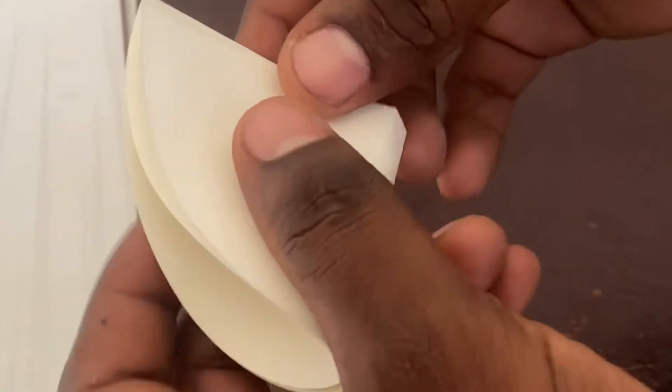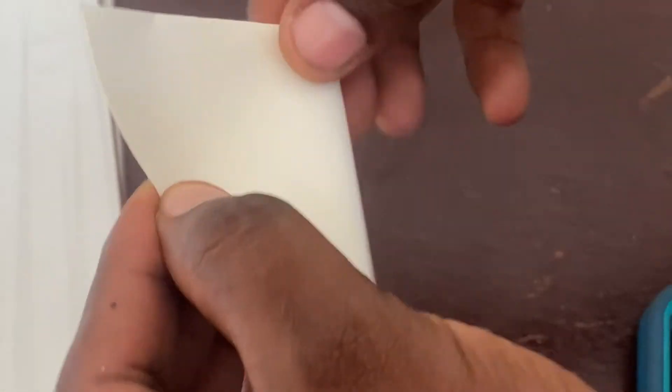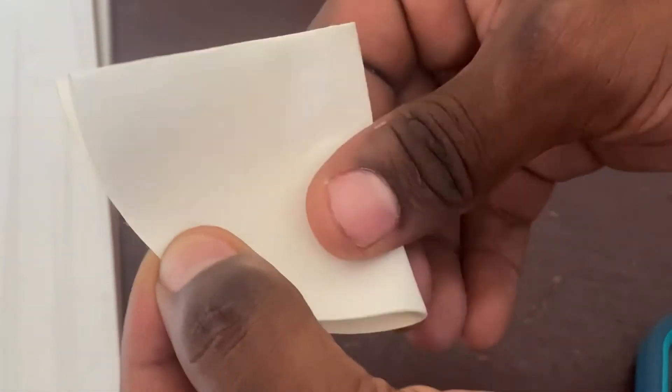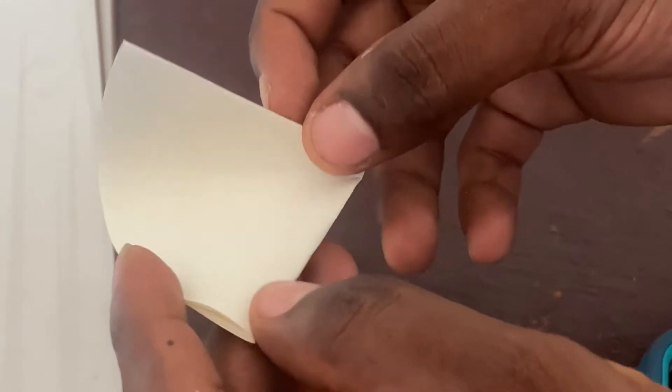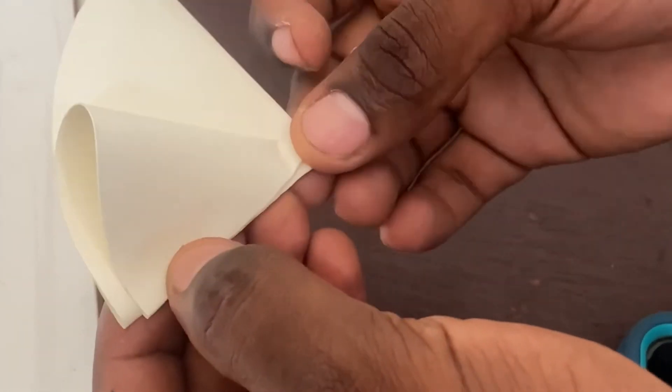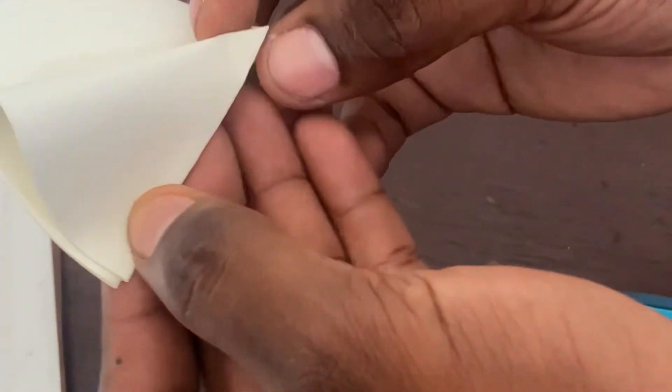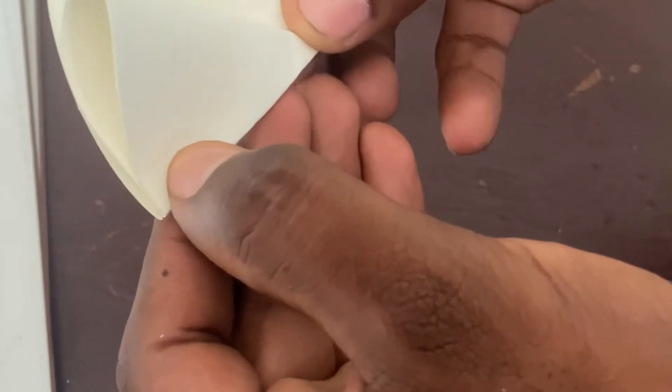We flute the filter paper by folding it into halves and creasing the sides, ensuring that the creases all lead to the middle point of the filter paper. This ensures that the separation takes place.